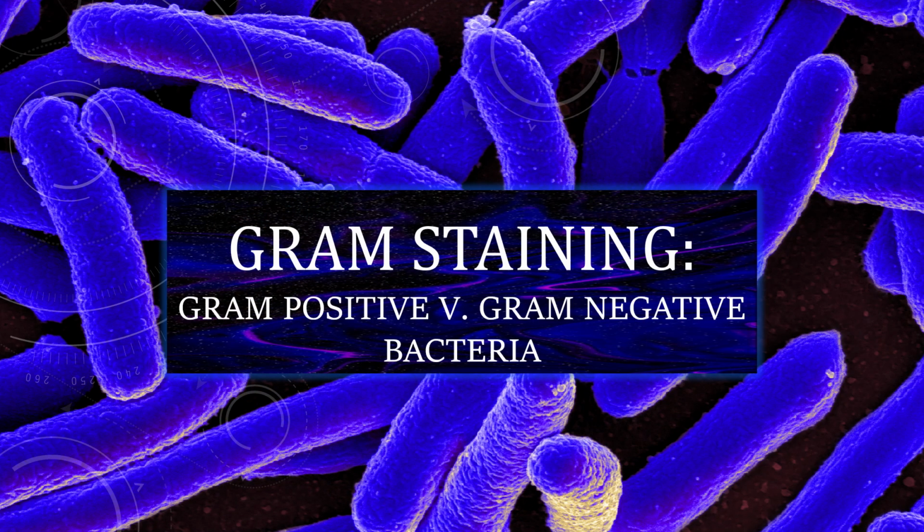Today we're going to be looking at how to conduct a gram stain and also be talking about the differences between gram-positive and gram-negative bacteria. So what are we waiting for? Let's get right into it.